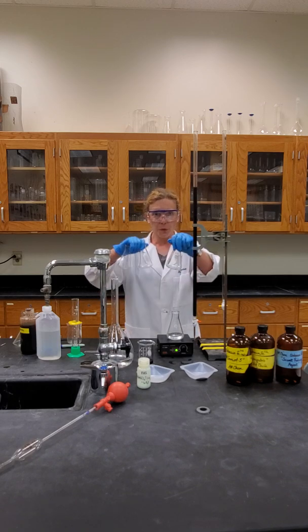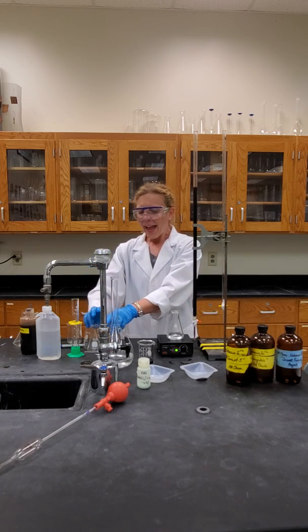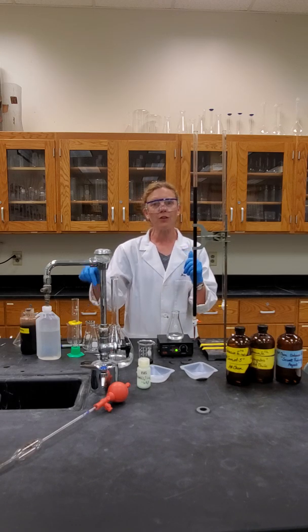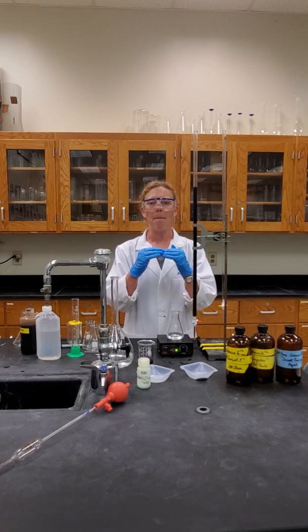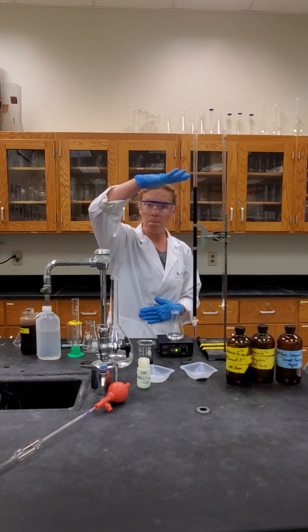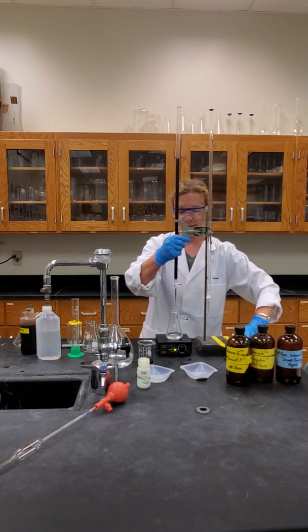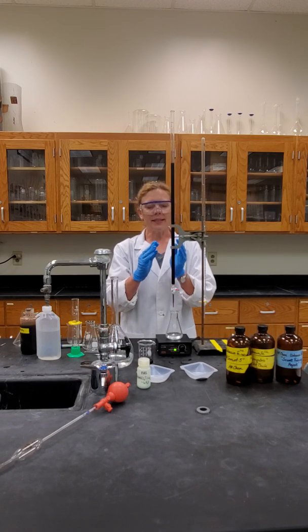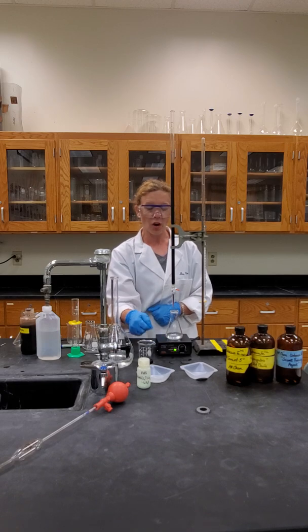So we have our three acidified iron samples. We know, because we've made them, the mass of the FAS, and we can convert that to get the moles of iron 2+ in each sample. Get the balanced reaction — you know how to create a balanced redox reaction; remember we're in an acidic environment. Then note the initial volume, and very carefully and patiently, especially with your first trial, we are going to titrate until the reaction shows us that we've added enough permanganate to react all the iron 2+.